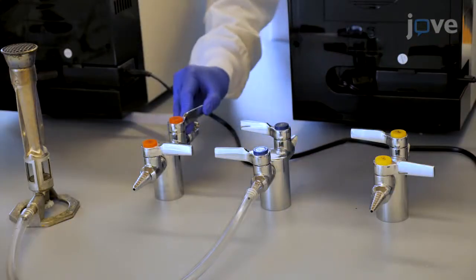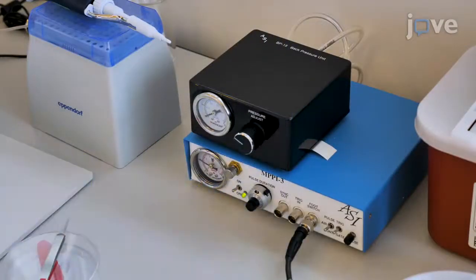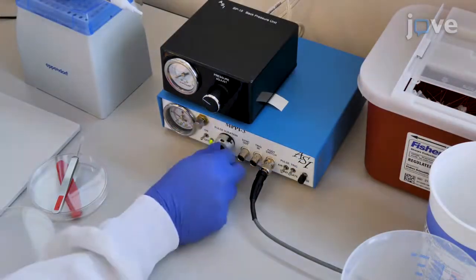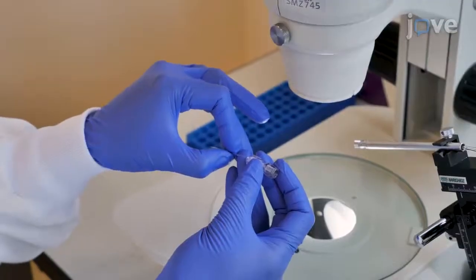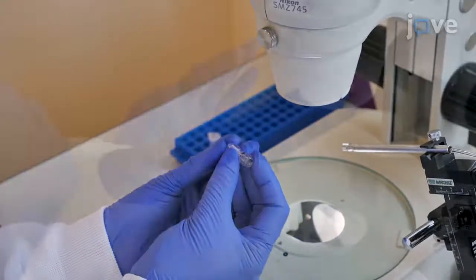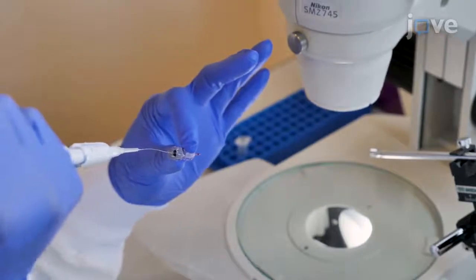Open the compressed air valve and turn on the microinjector. Set the pressure to about 25 psi, pulse duration to 60 milliseconds, and back pressure unit to 1 psi. Use a microloader pipette tip to load the microinjection needle with 3 to 5 microliters of PBS or spore suspension with phenol red.